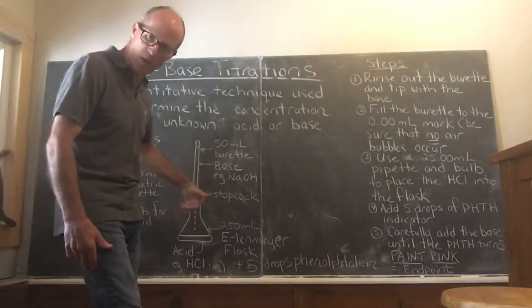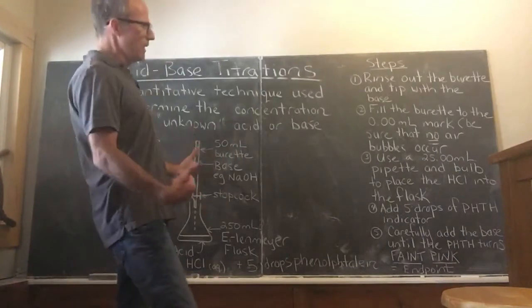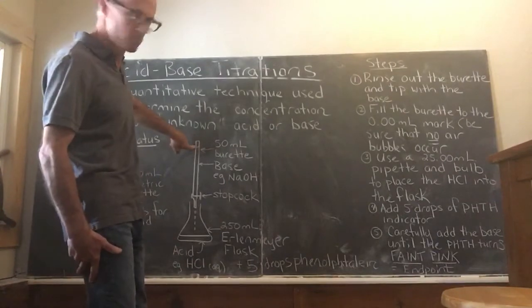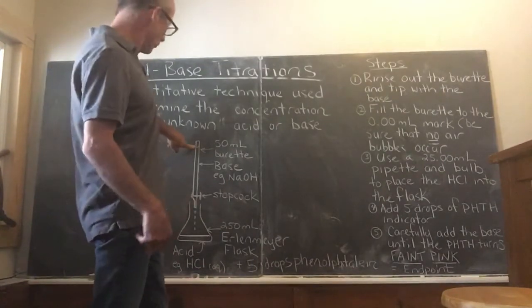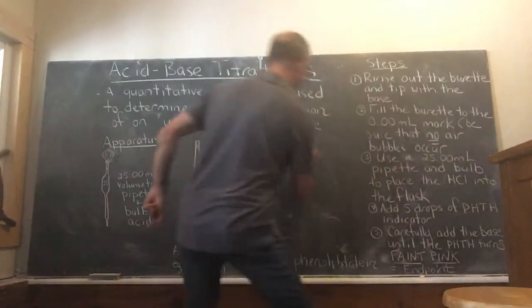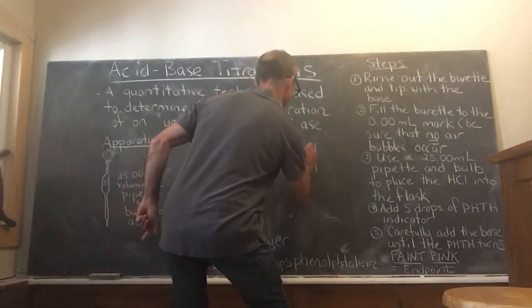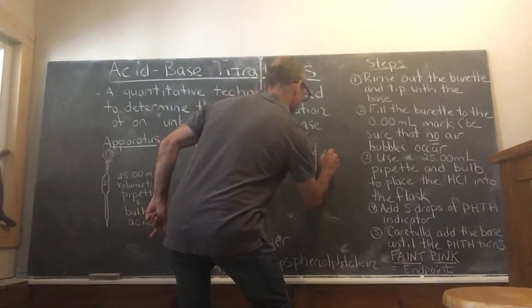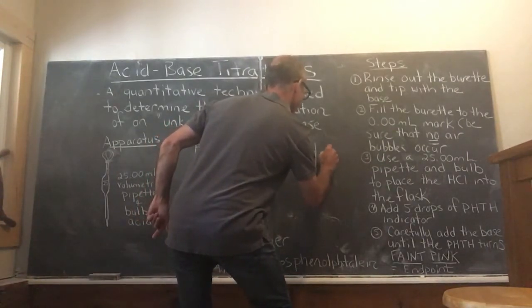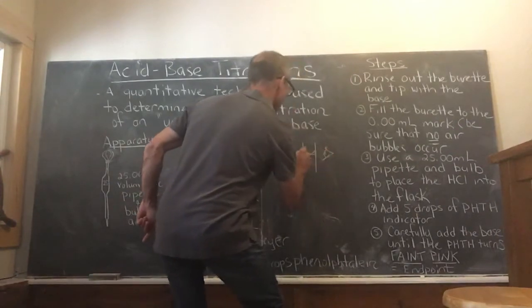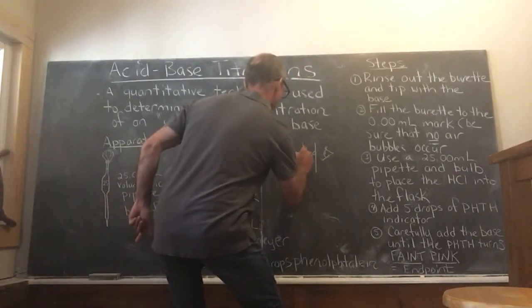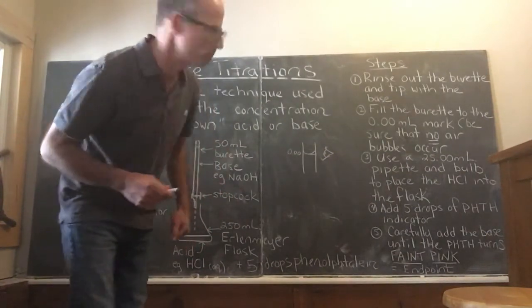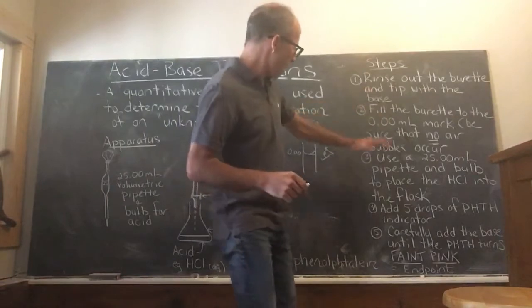Once you've rinsed out the burette and you've allowed some of it to go through the stopcock down through the tip, and you're confident that the entire burette is wet with the base, only then you can fill up the burette to the 0.0 mark at the very top. Use the bottom of the meniscus. Remember the bottom of the meniscus looks like this, and basically at eye level - there's your eyeball. This would be the top of the burette, and you would be confident that burette is full with base, no bubbles.